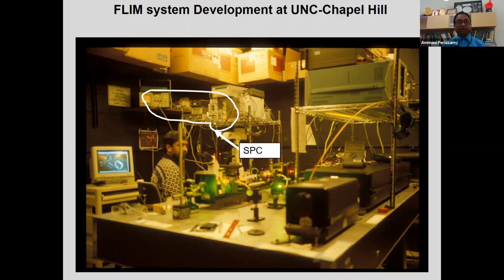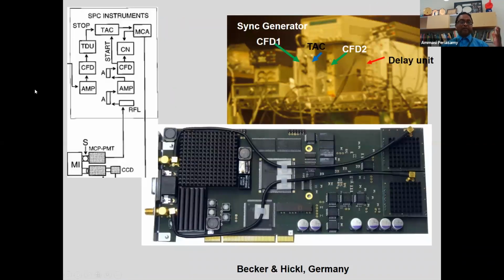All right. So now all the single photon counting electronics are in a single board. You can easily buy it and put it in your PC, connect it to the scanning microscopy system. You can collect lifetime imaging using a confocal or two-photon microscopy system.